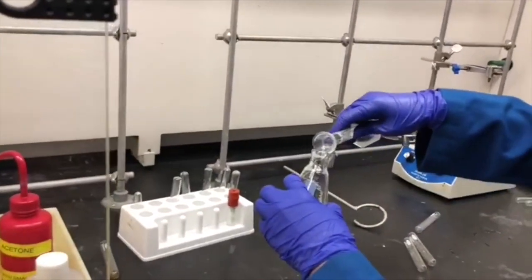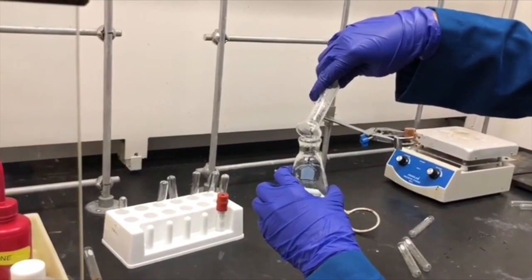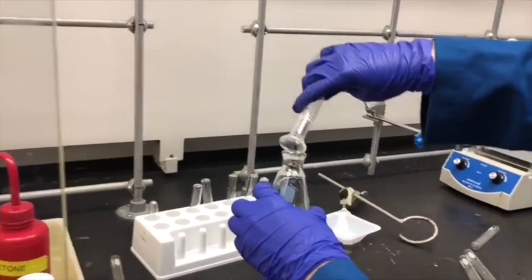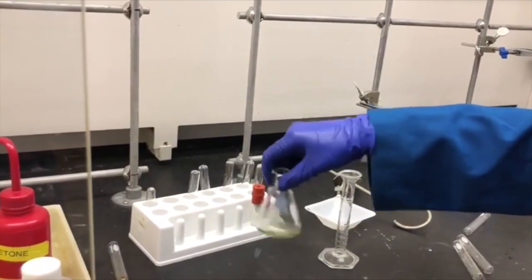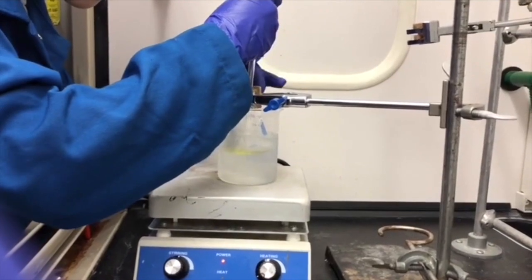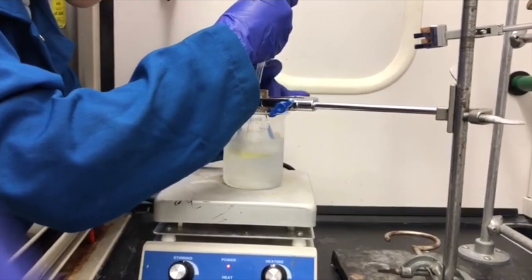And we put the weighed out methyl benzoate inside that flask before we added 1 mL of concentrated sulfuric acid, as you see me doing right there. We don't have to use a hot water bath as before because they're both liquid. We're adding the nitric acid and sulfuric acid mixture into the flask drop by drop.